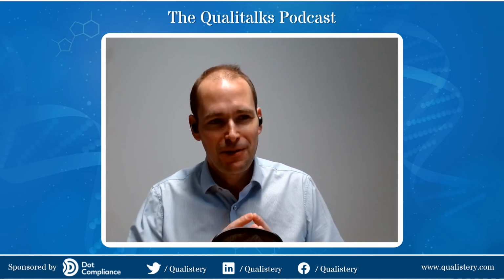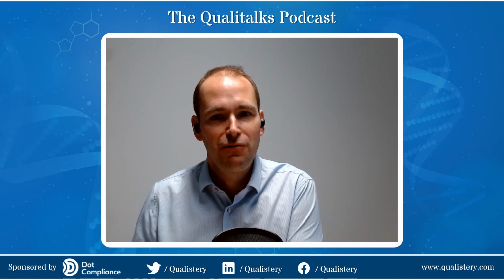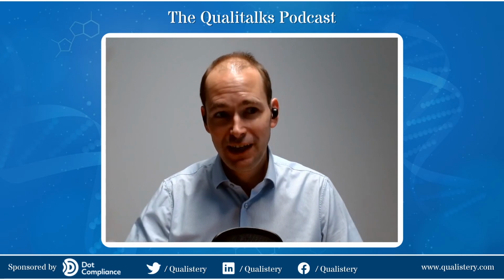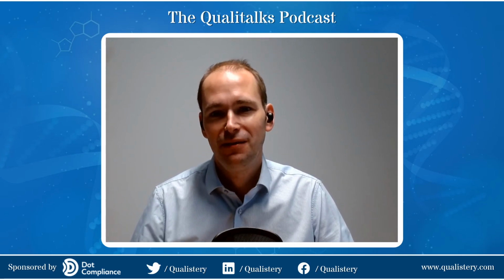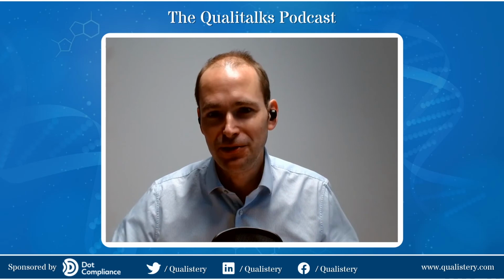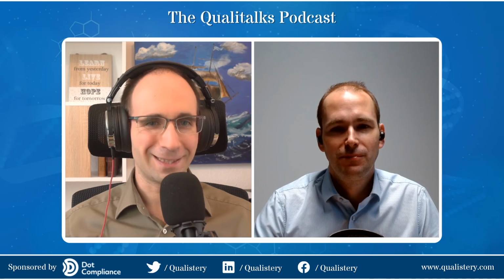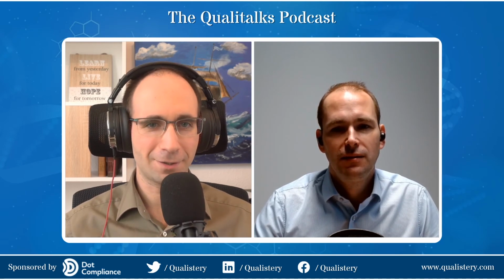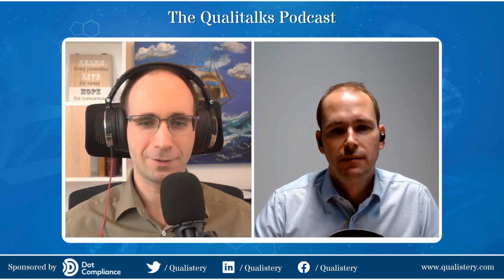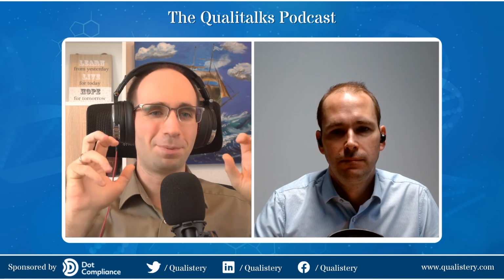So it's about understanding any changes that you make to an autoclave cycle and the potential impact that might have on the future. And it's very difficult to get that message across for people to understand that you really need to understand exactly what you're changing on an autoclave to ensure that it continues to function correctly. And you're not saving up issues for later on down the line, really. Right. So it's a really big process. A lot of background knowledge should be there, and there should be SMEs on the spot, because it's not just a production issue, a QA issue. You really need to understand how this simple equipment works.